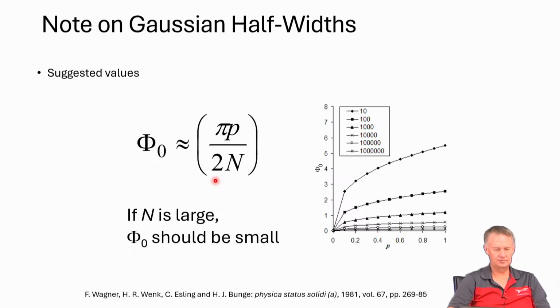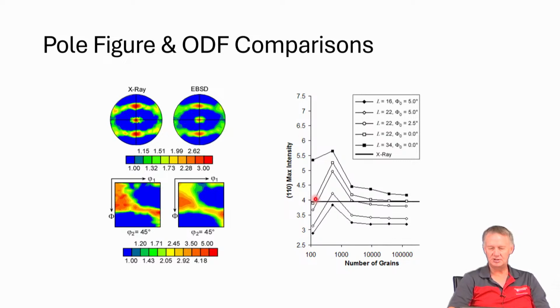So basically you are discretizing the region of the observation. The calculation procedure for EBSD requires that you go into a binning procedure, right? You put all the values in different bins, and the size of those bins is an input parameter, and then the half width spread for each individual orientation is an input parameter. So we're just talking about what kind of parameters you might want to use to get measurements that are more in line with what we might get with X-ray.